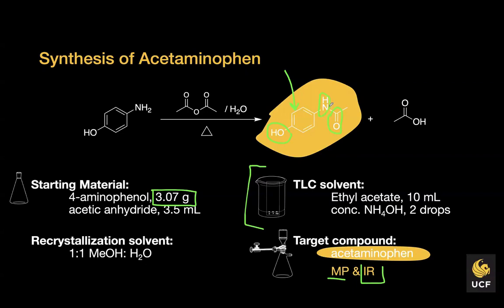For the amine, and make sure, within the module when we worked on IR, you can't simply put the range in general of all carbonyl oxygens. Look at carbonyl oxygens that are part of what we call an amide bond, right? That's an example of an amide bond, and those carbonyl oxygens have a specific wave number range, so keep that in mind.